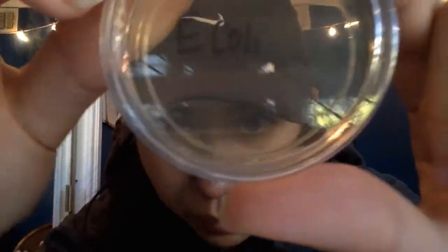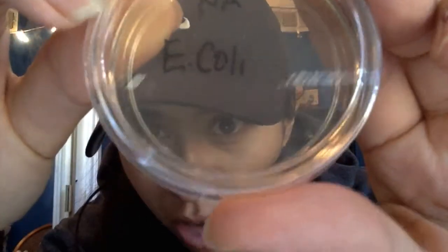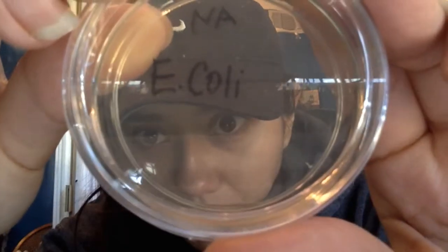And now here is the E. coli sample. Again, this would be the top quadrant, so it should have been the strongest quadrant with the most microbes, but there's nothing. So what I'm going to do is I'm going to go ahead and try letting it incubate for another 24 hours. I'll check on it tomorrow, and if I see any differences, I'll go ahead and update this video, but so far the only one that I was able to tell the difference between isolating the 4 quadrants was, again, the sample S. cerevisiae. So that's that.